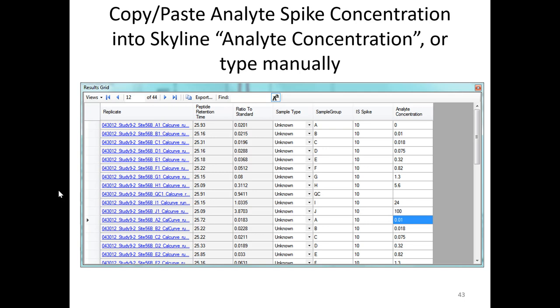Just leave it blank, or unknown, because it's a completely different set of peptides. It was in there by mistake. So for the SSS sample, leave it as unknown. Don't just ignore it for now. It's down near the bottom.